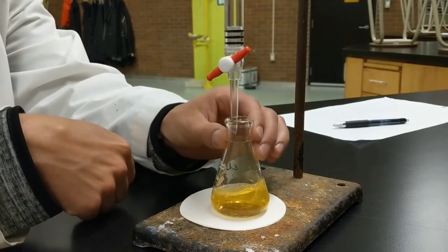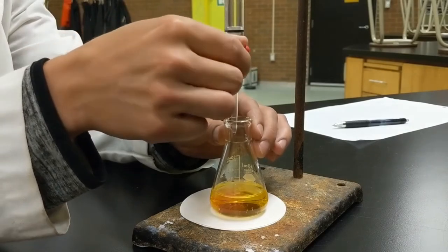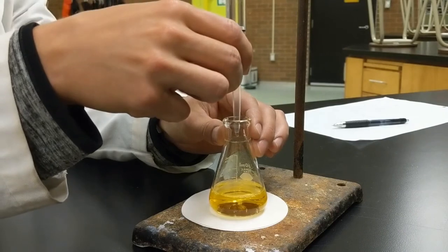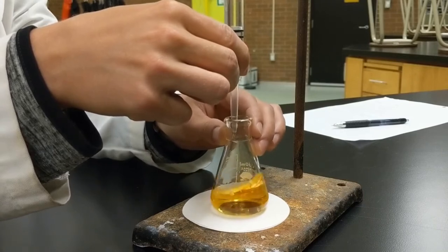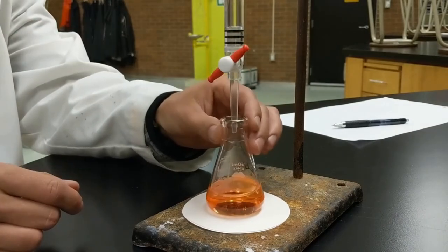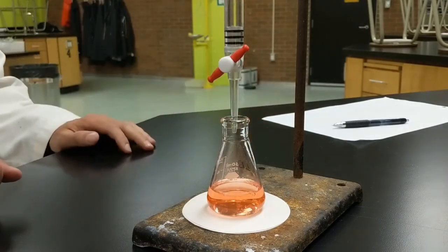You can see I'm putting a little in and swirling it around. You'll start to see some color change — a little bit of pink showing up as it drops in. I know I'm getting close to the end so I'm going slower now, a few drops at a time. It's very easy to turn the tap the wrong way and have too much come through — kind of like that.